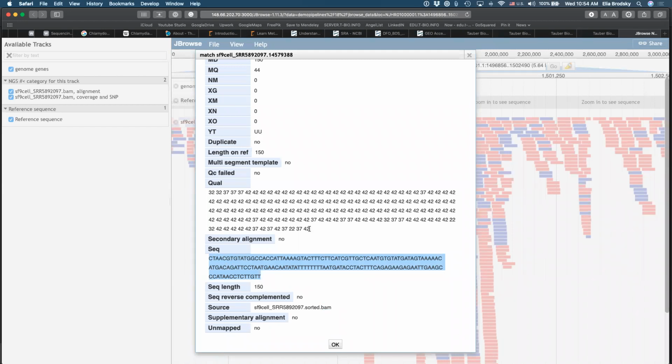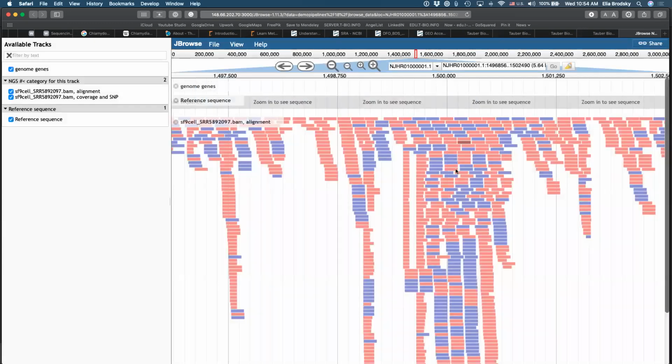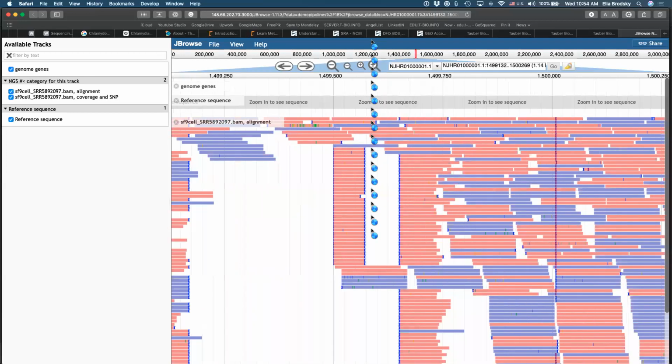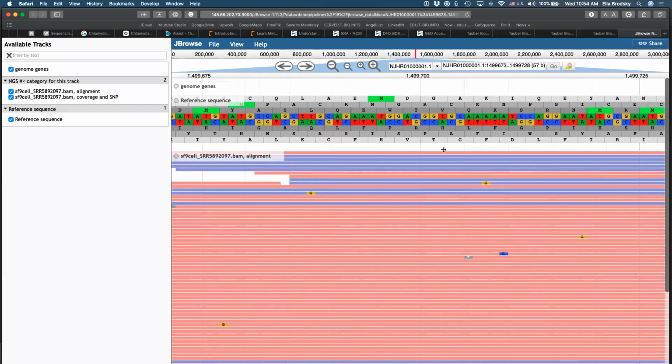It has variable quality across the nucleotide sequence, but it is mapped onto a particular reference in the genome. So if we want to see where it maps to, we have to zoom in to see the sequence. So we can zoom in more. Okay, and here we can start seeing the sequence and the reading frames and how they are converting to amino acids. So this is actually the raw data that has been processed, right? We have aligned it to the reference genome.